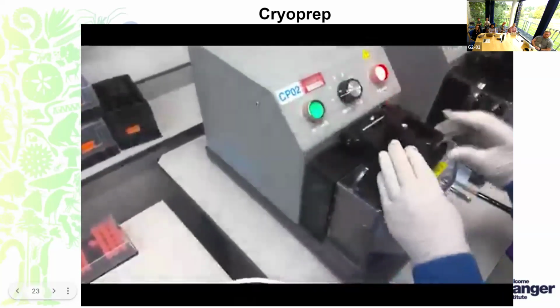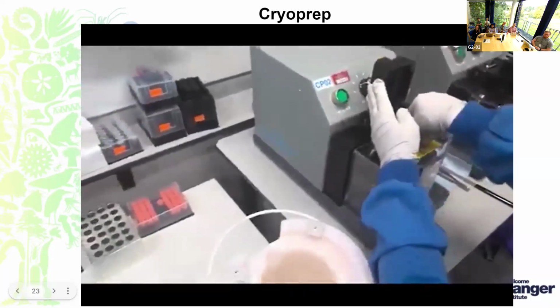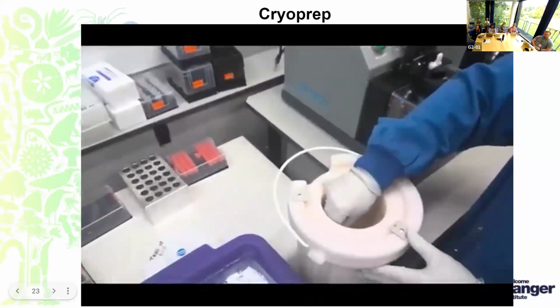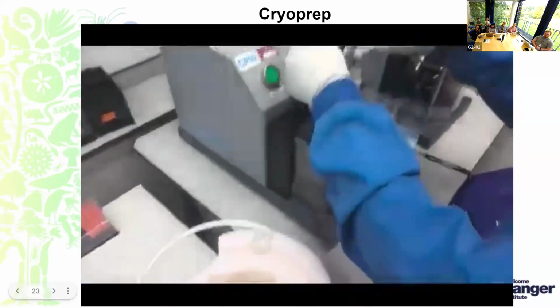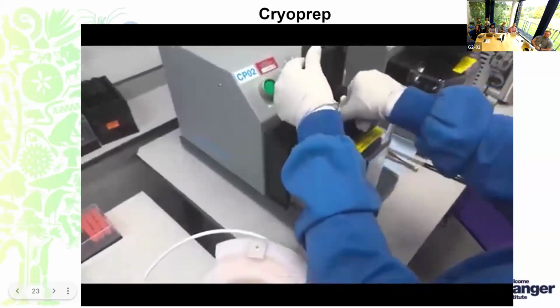Once we know the larger tissue material is disrupted appropriately, we move on to different impact levels. This impact level is also being optimized for different taxon groups. For instance, for this sample, we start off with 1 and then move on to 2, and later we move on to higher impacts based on the disruption it requires. When we used to do cryoprepping for plants and fungi, we used a higher level of impacts compared to the mollusk and chordate samples.